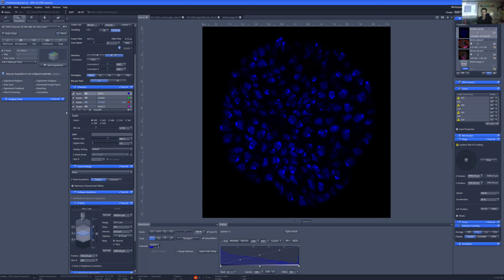I know you mentioned yesterday that this organ is quite small. These ovaries are small, you're imaging the tip of an ovary. Or the tip of a compartment of an ovary even. What is the distance between each of the images that you're taking? The distance between each of the images is a quarter of a micron.